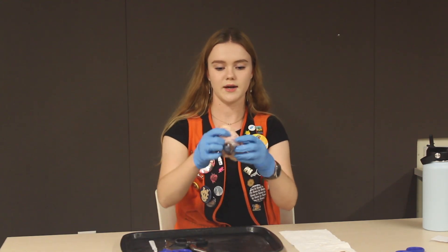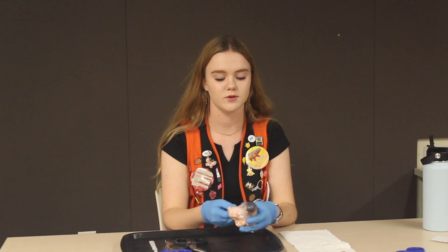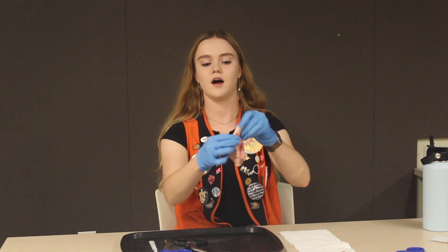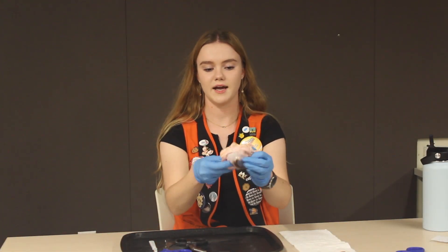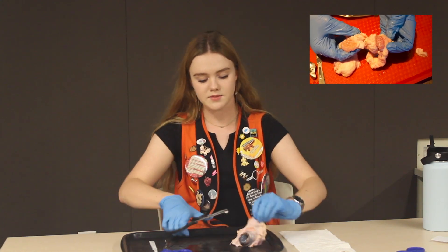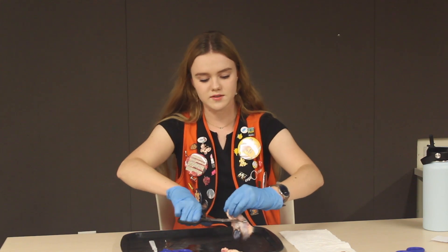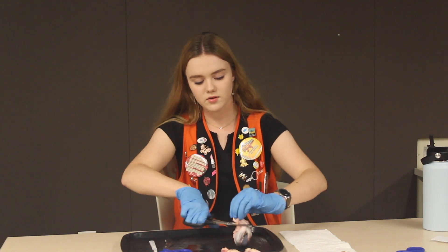So right here we have our cow eye and you may be wondering why we do cow eye dissections here at the Exploratorium. I like asking visitors that to get their heads in the right space, and while I'm asking these questions I already start to cut off the fat and the muscle. The fat is this lighter pink stuff surrounding the eye and the muscle is this darker pink right here. The fat protects the eye and keeps everything in place, and the muscle allows the eye to move.